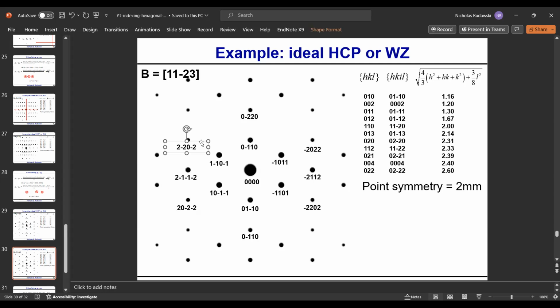So let's delete all these other ones except G1 and G2. Okay, so just by inspection, we can just rearrange this guy to give us that, and we're going to get a 0 dot product, to make our lives easier. So now we have to figure out how to reassign these indices.